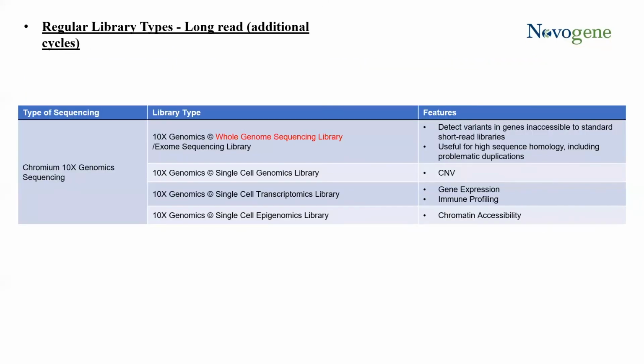So just what's blowing up in the sequencing world right now is the 10x genomics platforms. So the 10x genomics platforms, it's also very important to understand, one, what these capture kits do, and two, how these can affect other 10x libraries if loaded on the same lanes.